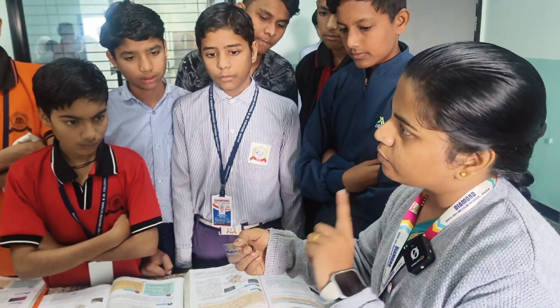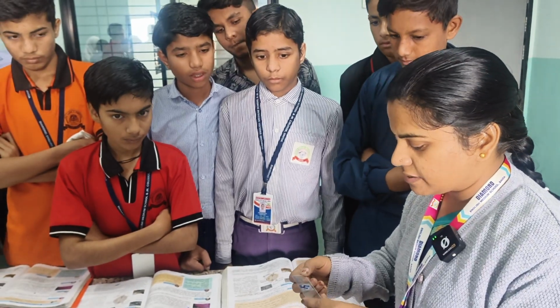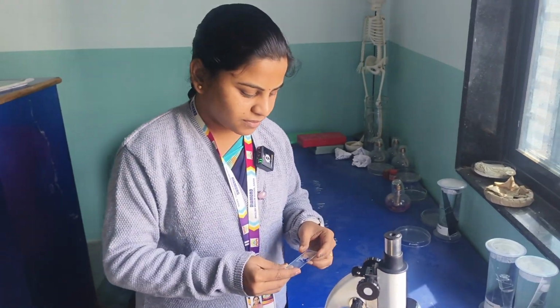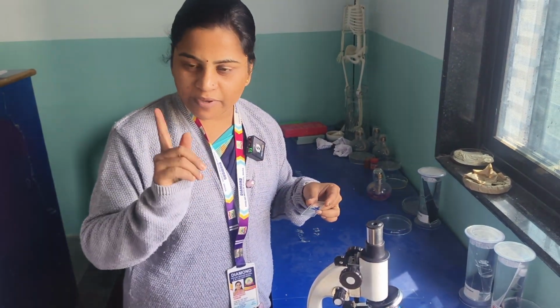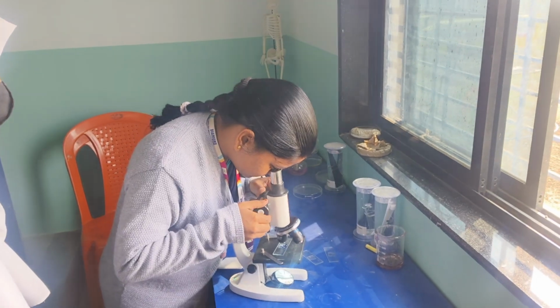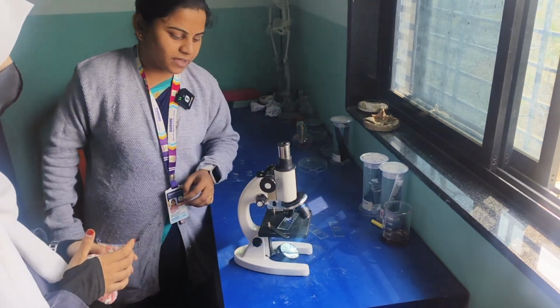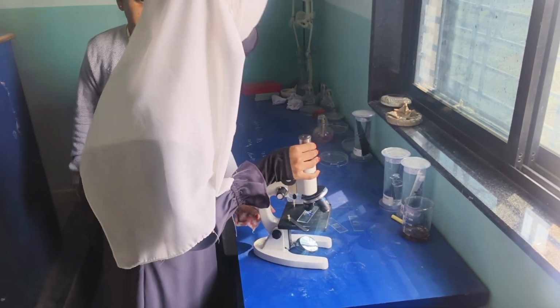Now this slide we have to see in a compound microscope. Let us see this slide. Students, you know this is a compound microscope. Come here, girls. Now we are going to focus this slide under the compound microscope in 10x. Yes, you can see these rod-shaped bacteria, which are lactobacilli. One by one, come and see this slide.